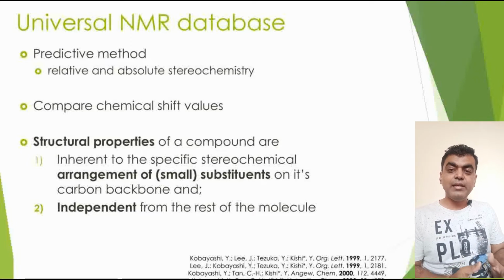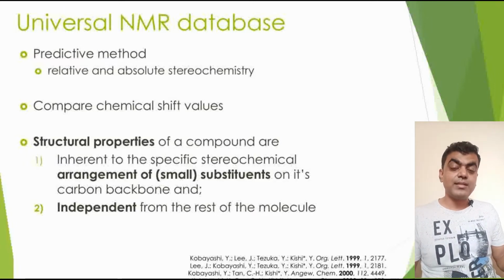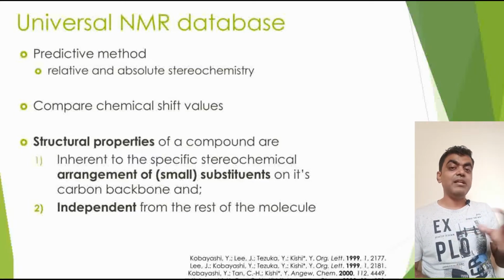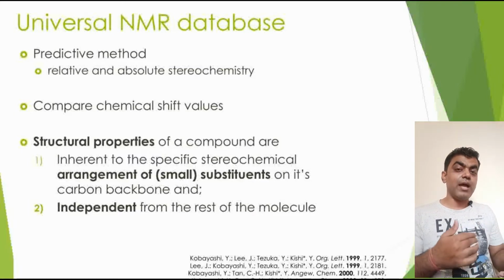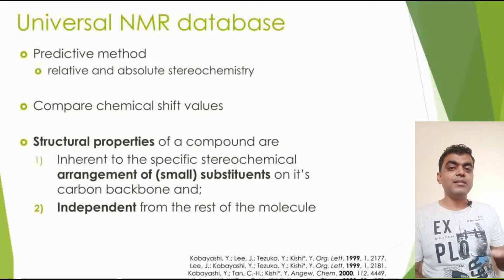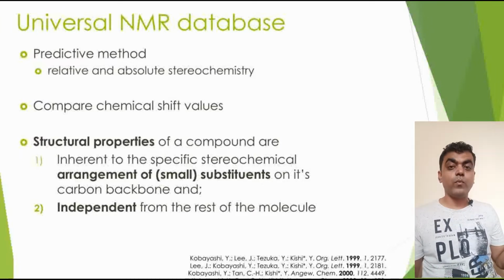So ideally, suppose you have C6H12, in this case, if you say H12 protons are there and I am expecting them, it may not always be true, because you also have to understand the stereochemistry of the compound, because they may keep rotating. There can be a cis-trans rotation, there can be DL rotations, there can be aromatic rings. All these things you have to keep in mind can happen with your sample, and based on that the 1D spectra can run and look very different from what you are expecting.